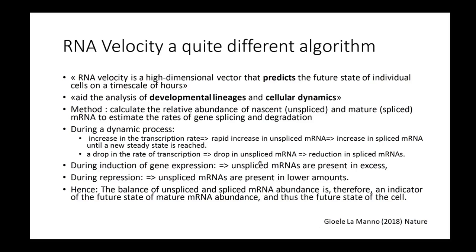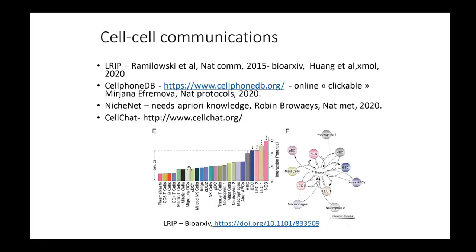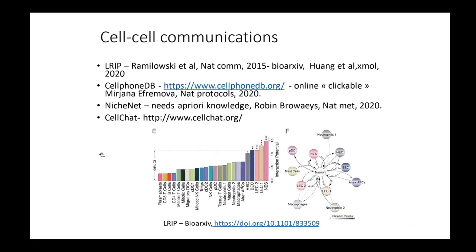Okay, perfect. So the last part of what I want to show you is how you could do cell-cell communication. I did not put the single cell RNA tools here, but there are quite a few cell-cell communication tools that exist. I mentioned some of them here because I have a bit of a sense of what they did, since I tried them. But there might be others that you would like to add at the end, Gert or Tanya.